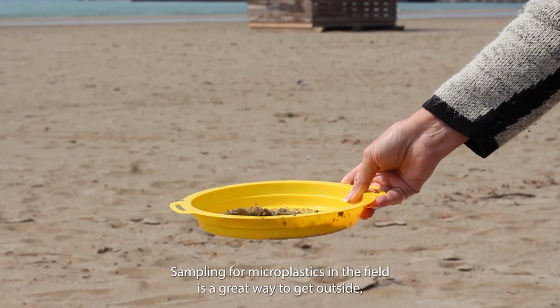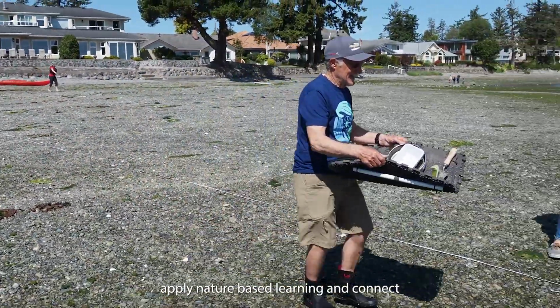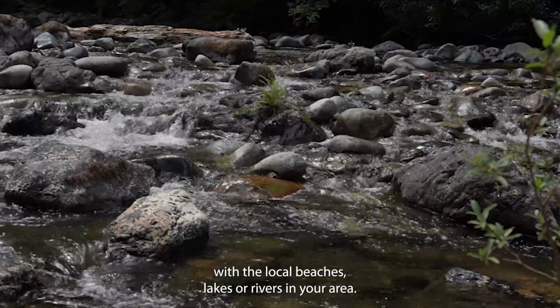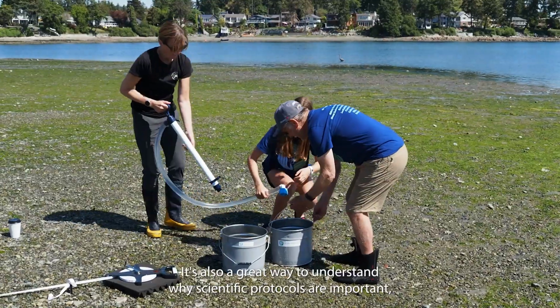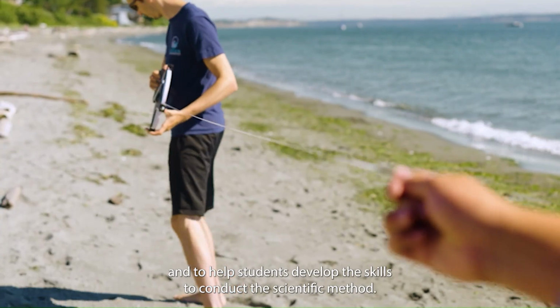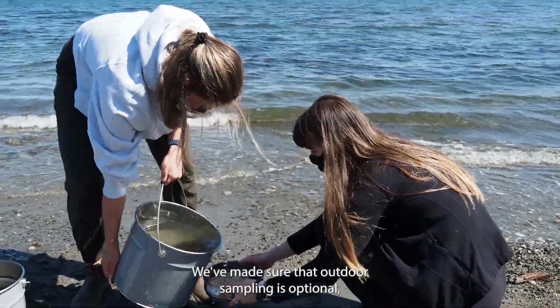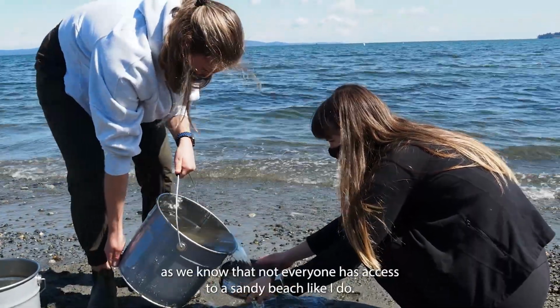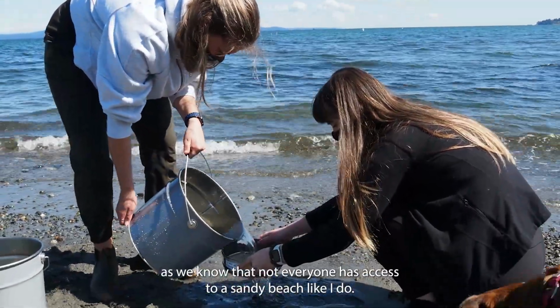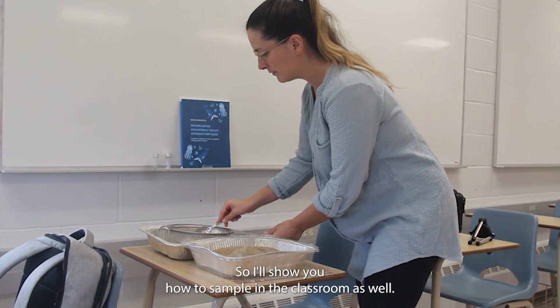Sampling for microplastics in the field is a great way to get outside, apply nature-based learning, and connect with the local beaches, lakes, or rivers in your area. It's also a great way to understand why scientific protocols are important and to help students develop the skills to conduct the scientific method. We've made sure that outdoor sampling is optional, as we know not everyone has access to a sandy beach like I do, so I'll show you how to sample in the classroom as well.